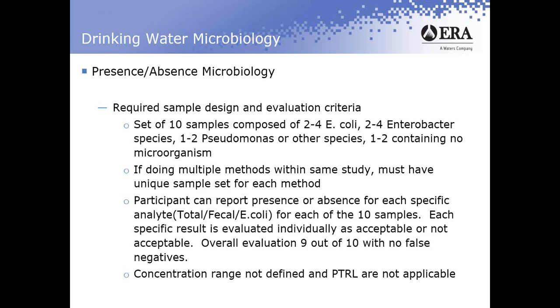Now, participants can report presence or absence for each specific analyte. So total fecal and E. coli are all listed on the table for each of those 10 samples. Each specific result will be evaluated individually for each of those 3 parameters as acceptable or not acceptable.